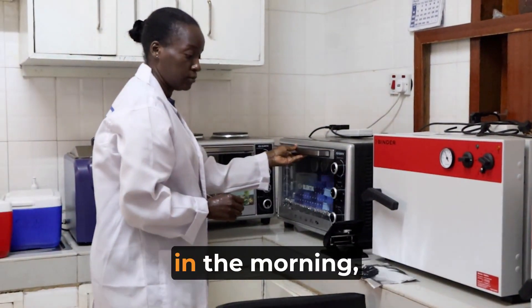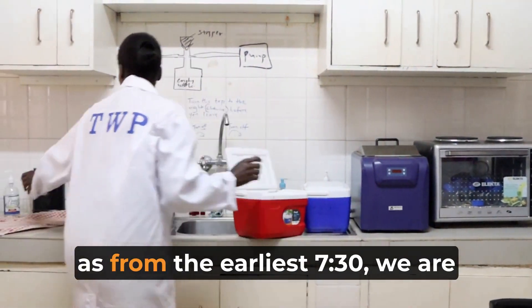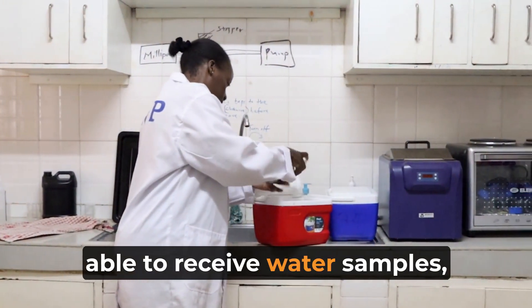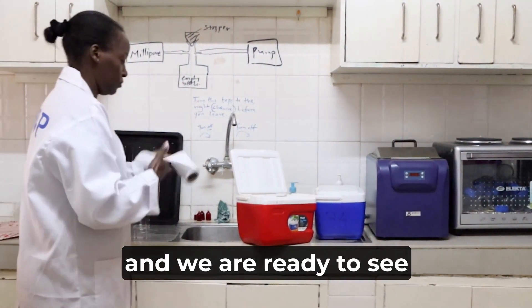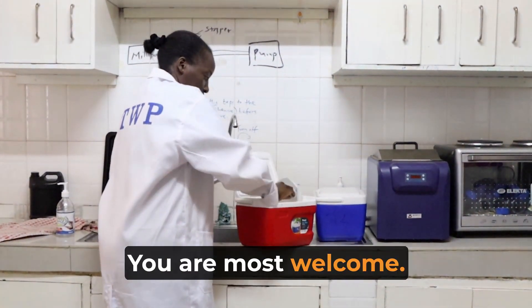Then after that we are able to receive samples in the morning — very early in the morning, from as early as 7:30 — we are able to receive water samples and we are ready to see how the day goes. You are most welcome.